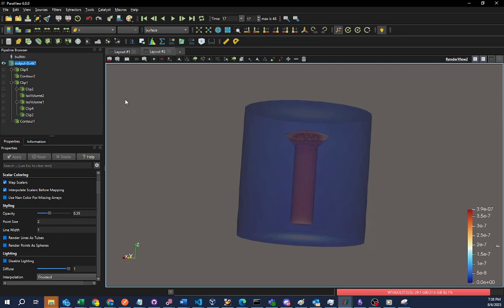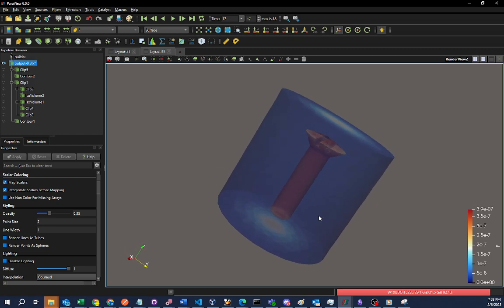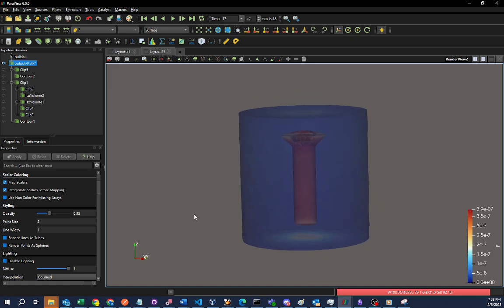So today we are going to look into a 3D visualization of a screw that will be degraded in a solution of chemicals. It's a 3D data set, and I'm looking at the 3D data set using a 3D visualization tool called ParaView.